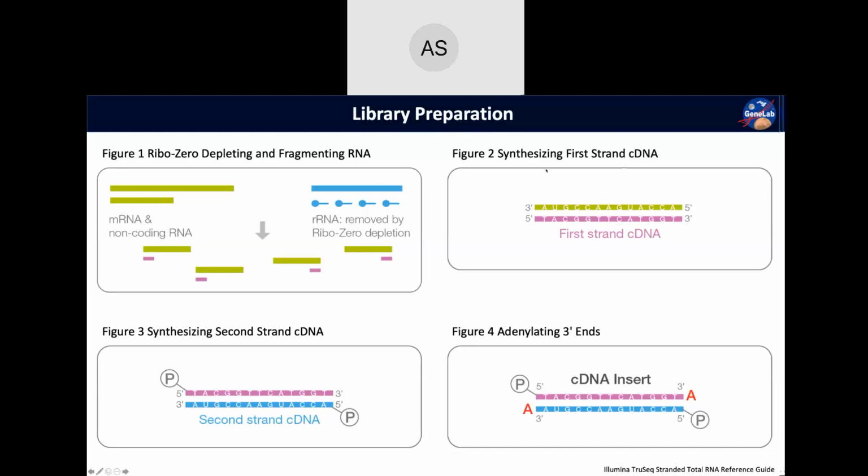So when you're doing your aligning, rather than having to align to the genome in two different directions, you only have to align in one direction, and that also increases accuracy of your counting. Yes. But originally it was not thought about, as the direction of the source of your RNA. Originally, it wasn't.